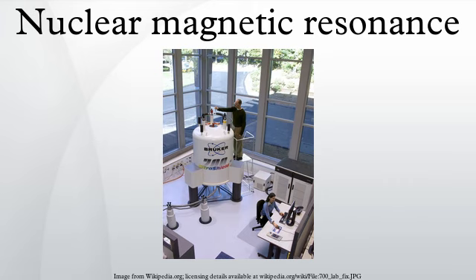NMR spectroscopy. NMR spectroscopy is one of the principal techniques used to obtain physical, chemical, electronic and structural information about molecules due to either the chemical shift, Zeeman effect, or the Knight shift effect, or a combination of both, on the resonant frequencies of the nuclei present in the sample. It is a powerful technique that can provide detailed information on the topology, dynamics and three-dimensional structure of molecules in solution and in the solid state.